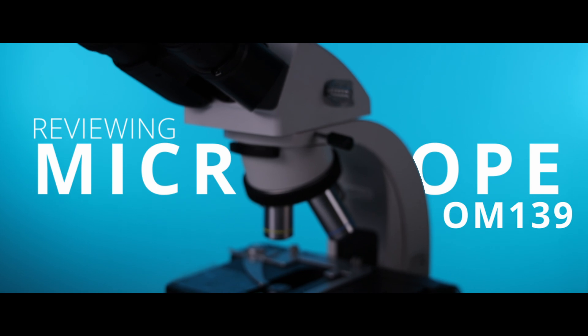Hello everyone. Today we're going to review the microscope OM139. I'm excited. Let's start.